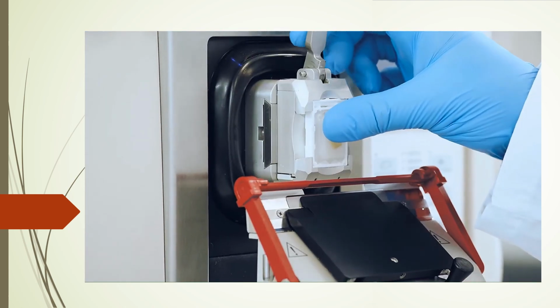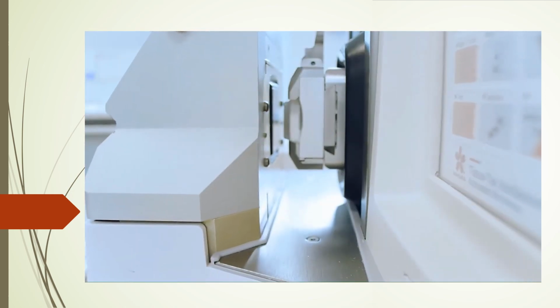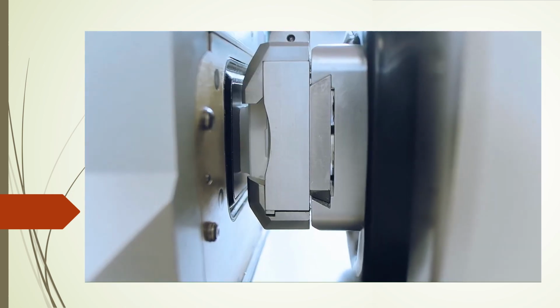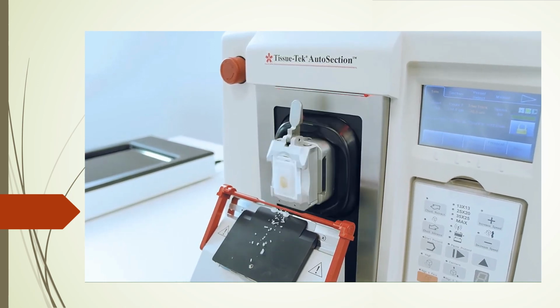Modern models of automated microtomes allow obtaining high-quality serial sections, but this stage of histological processing is carried out under the control and participation of the operator.